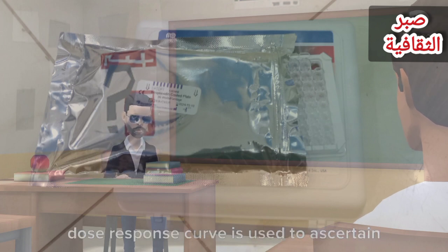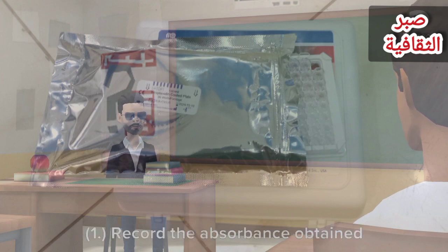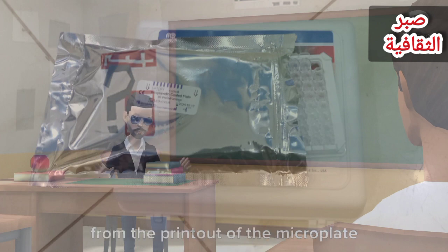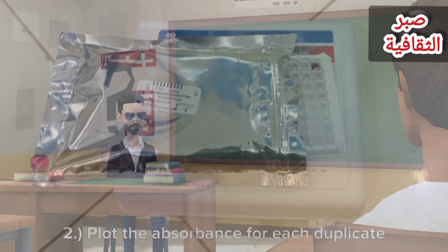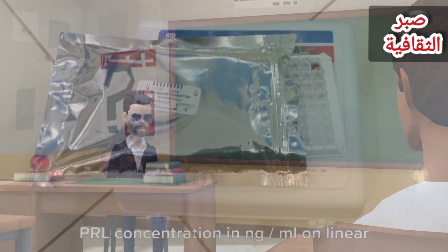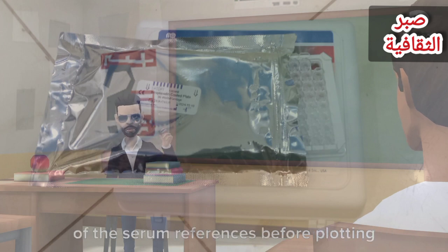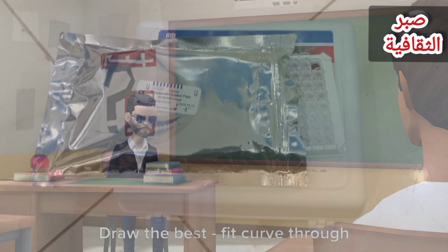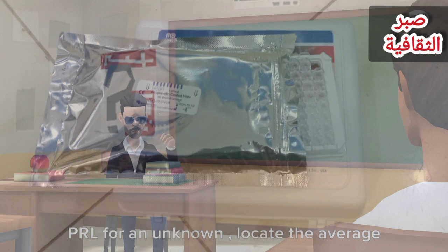10.0 Calculation of results. A dose-response curve is used to ascertain the concentration of prolactin hormone, PRL, in unknown specimens. 1. Record the absorbance obtained from the printout of the microplate reader as outlined in example 1. 2. Plot the absorbance for each duplicate serum reference versus the corresponding PRL concentration in ng/milliliter on linear graph paper. Do not average the duplicates of the serum references before plotting. 3. Draw the best fit curve through the plotted points. 4.